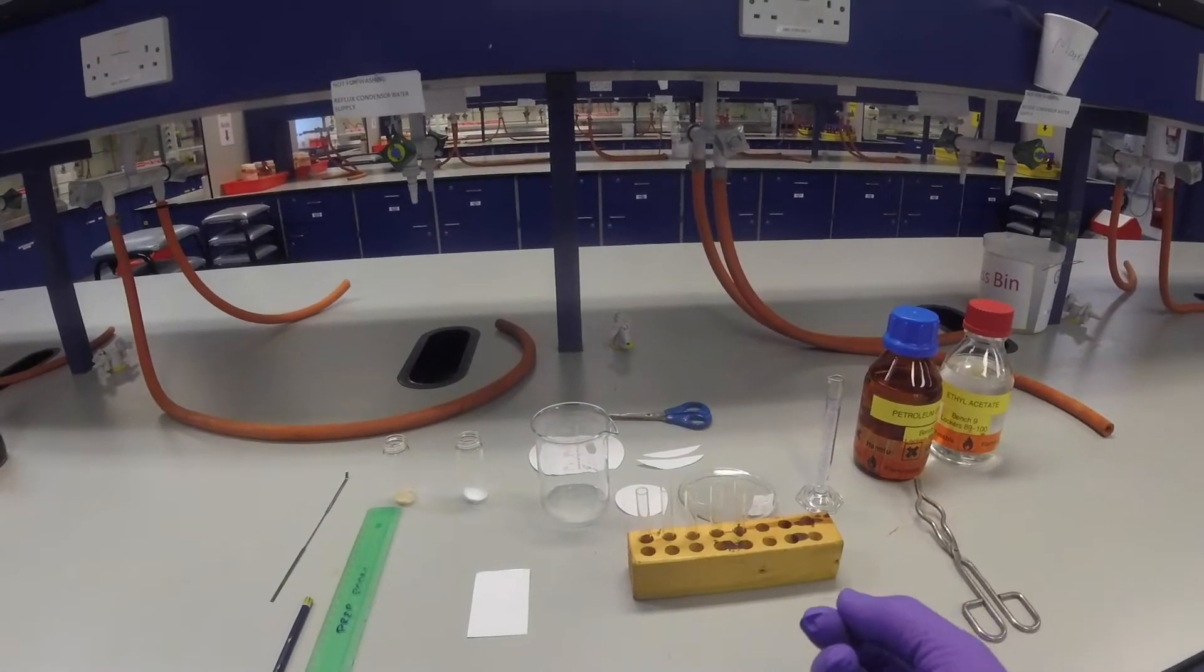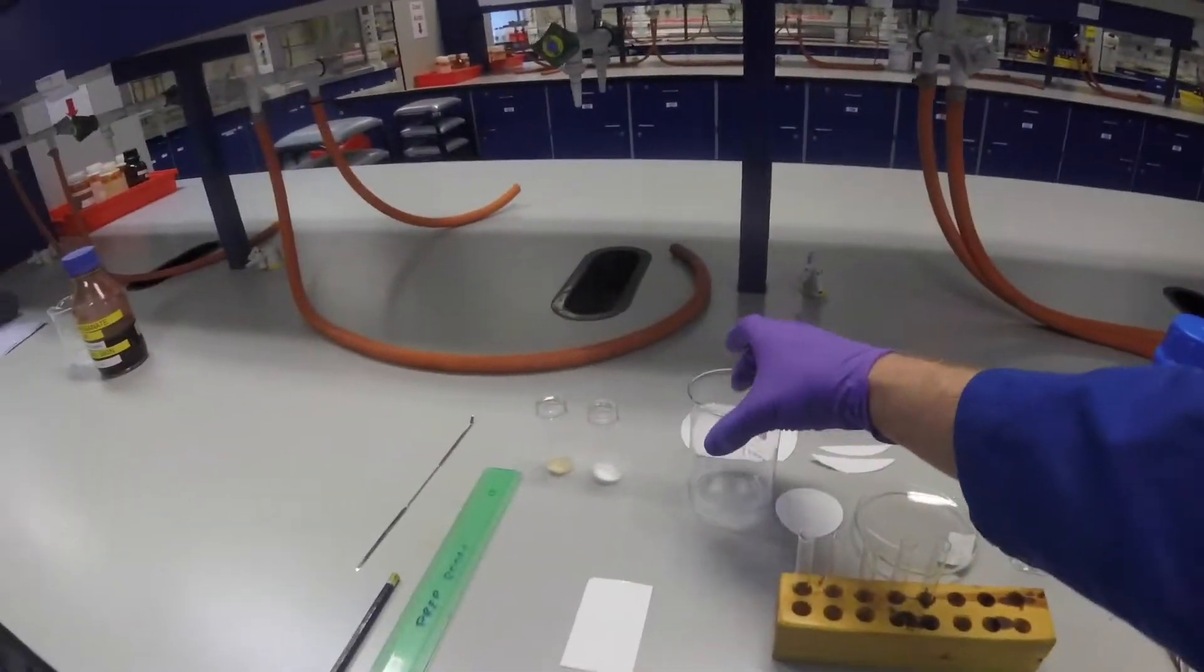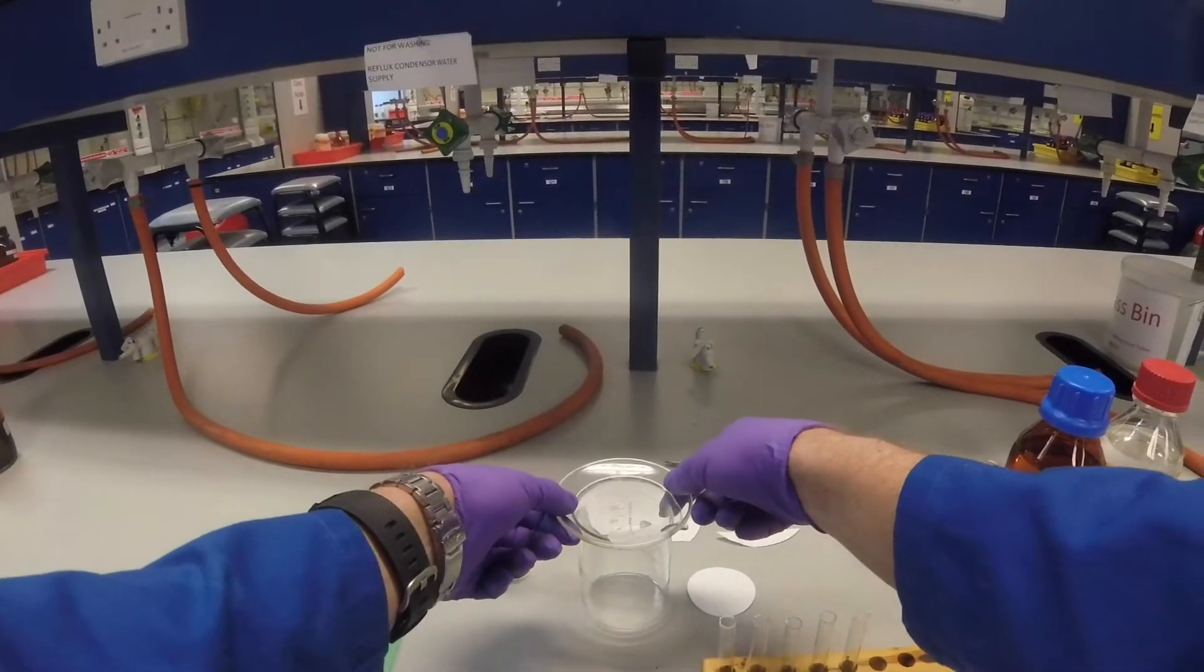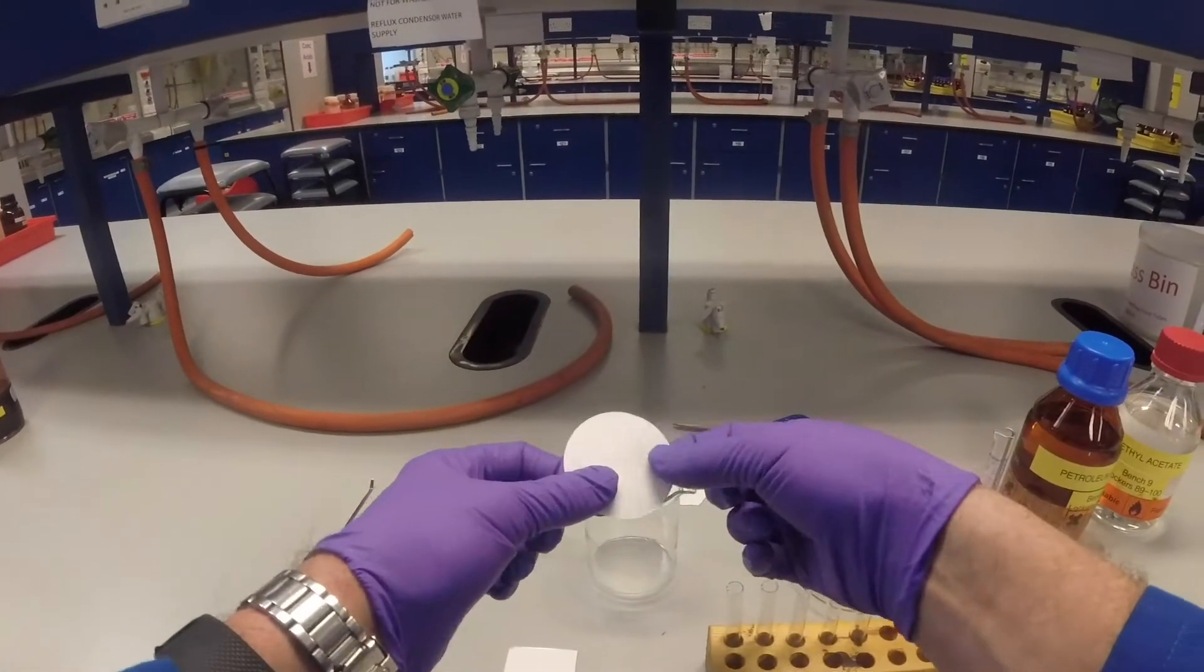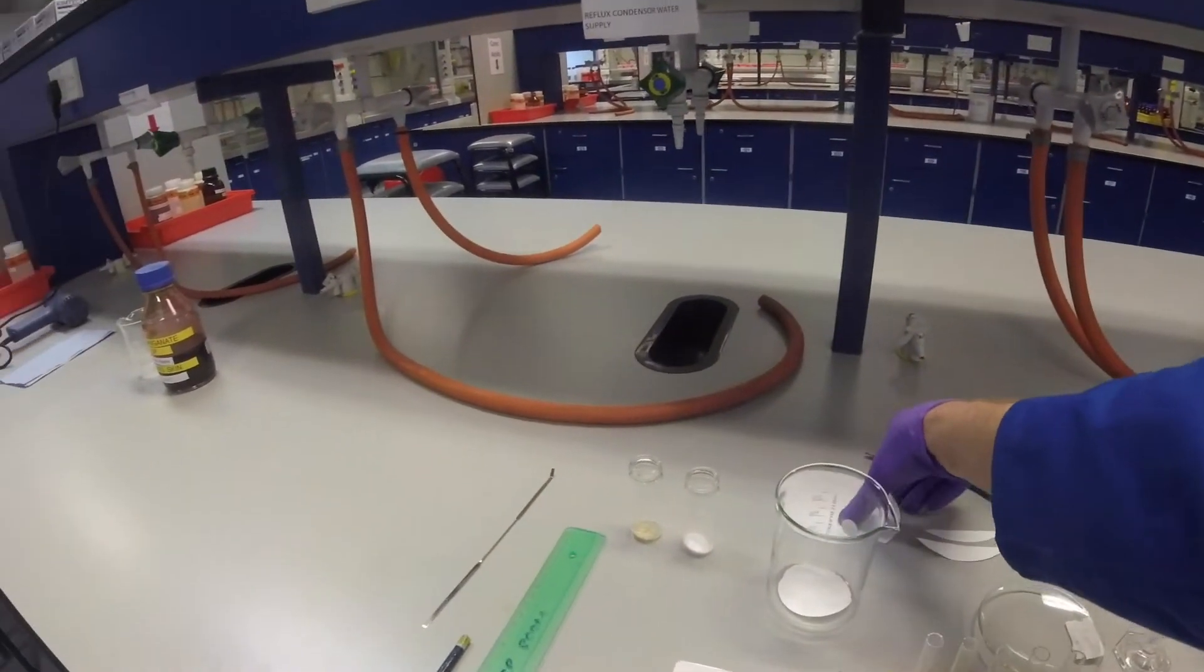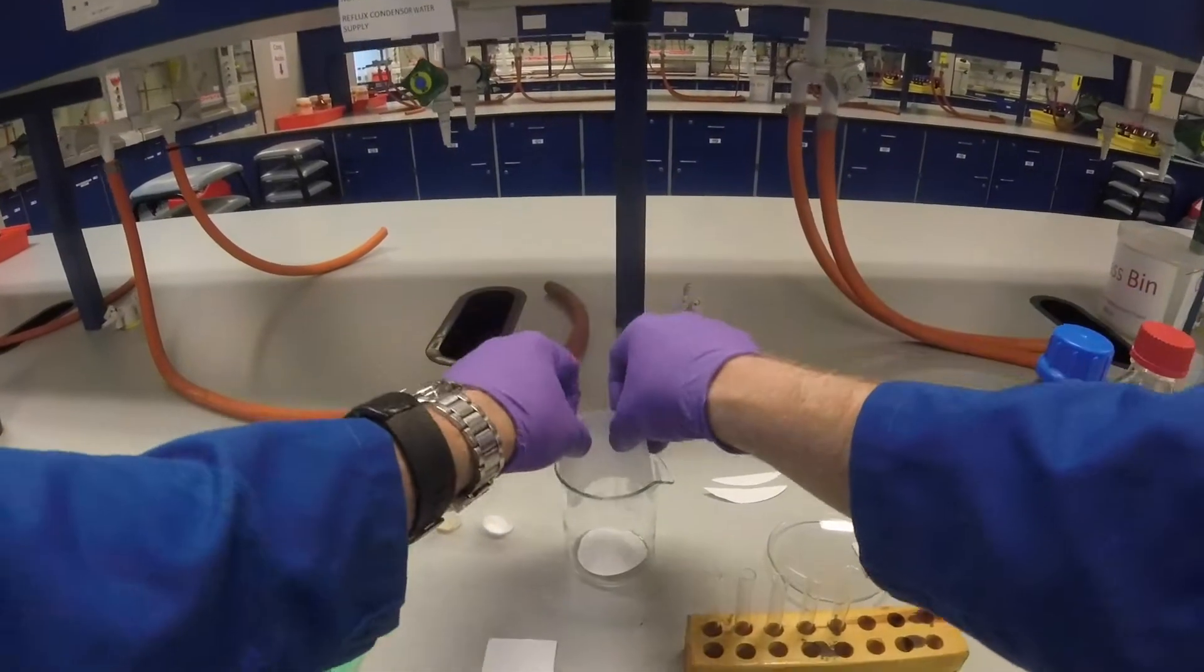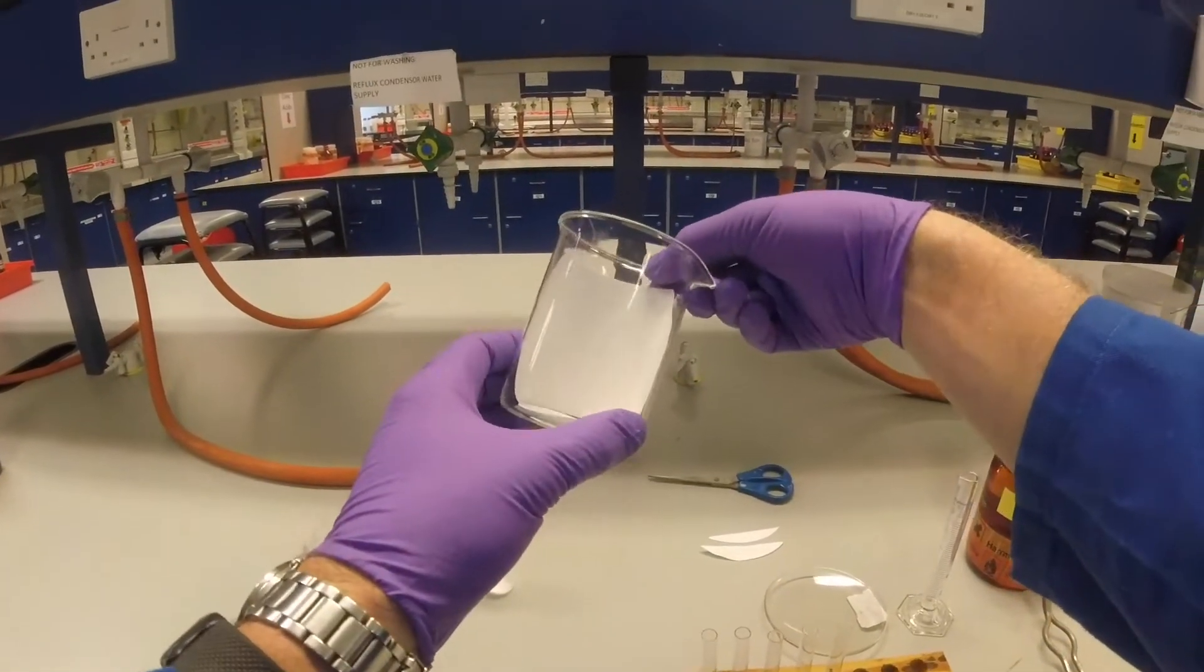The things you're going to need to do a TLC are your samples that we're going to check, a beaker to act as a TLC tank, a watch glass to go over the beaker to stop the solvent evaporating, a small piece of filter paper to go in the bottom to stop your TLC plate sliding around, and a larger piece of filter paper with the top and bottom edges cut off that lines the side of the TLC tank.